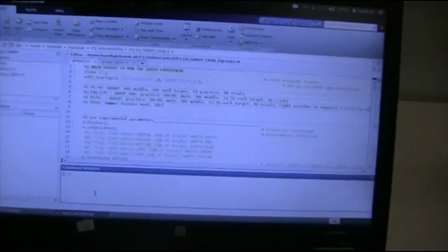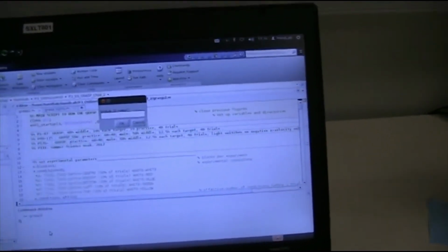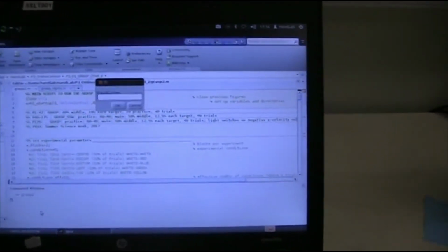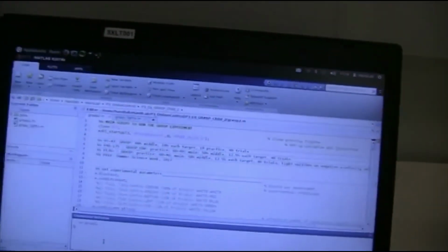The experiment is started by running the grasp2.m program. If it's working, it'll ask for an ID number. Then, if you want to do some practice trials, and if all that's working, a graph will come up. If you get to this stage, you know that the computer is communicating correctly with the tracker.